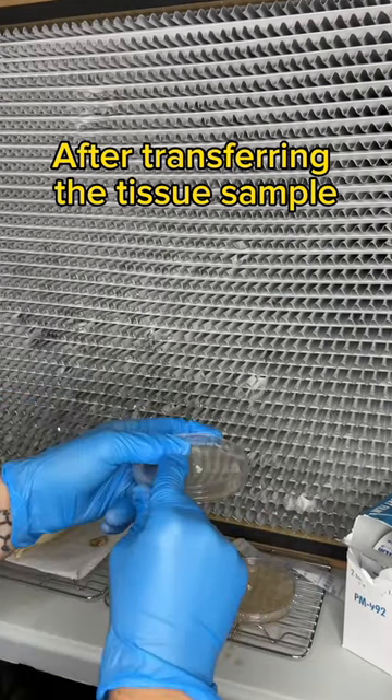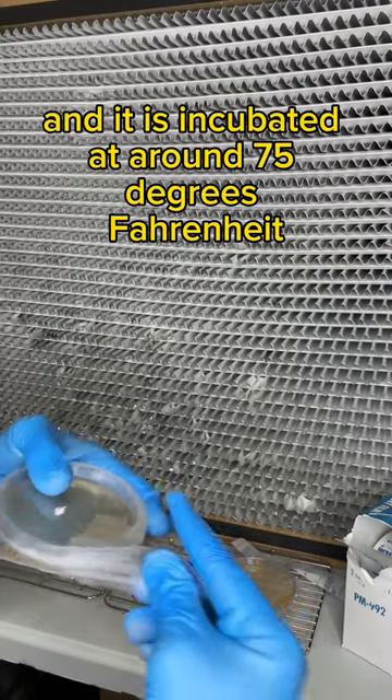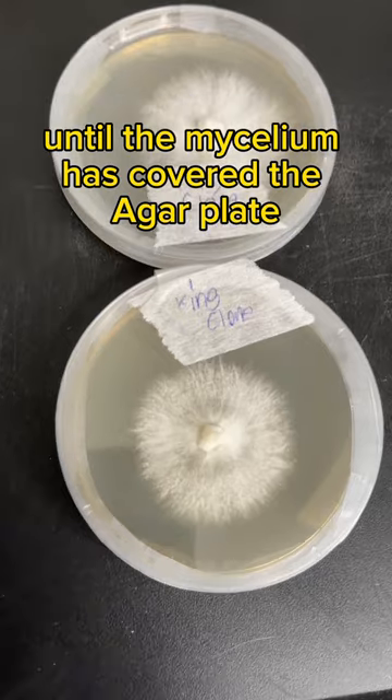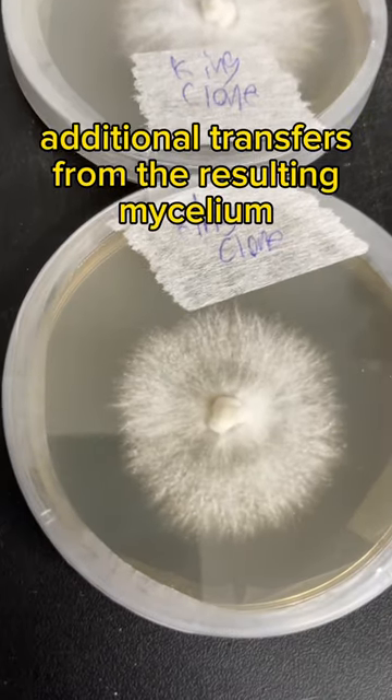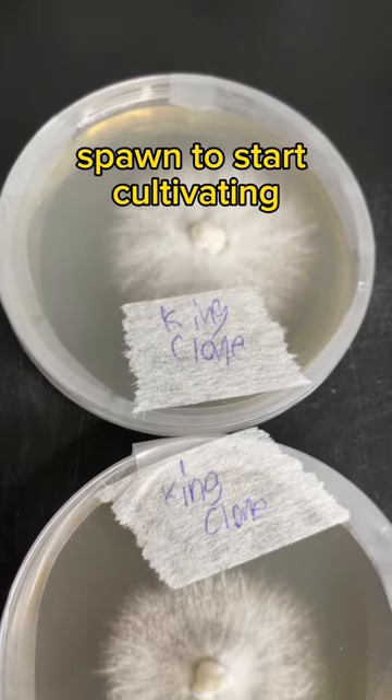After transferring the tissue sample, the agar plate is wrapped in parafilm or saran wrap and it is incubated at around 75 degrees Fahrenheit until the mycelium has covered the agar plate. You can make additional transfers from the resulting mycelium or you can expand it to grain spawn to start cultivating.